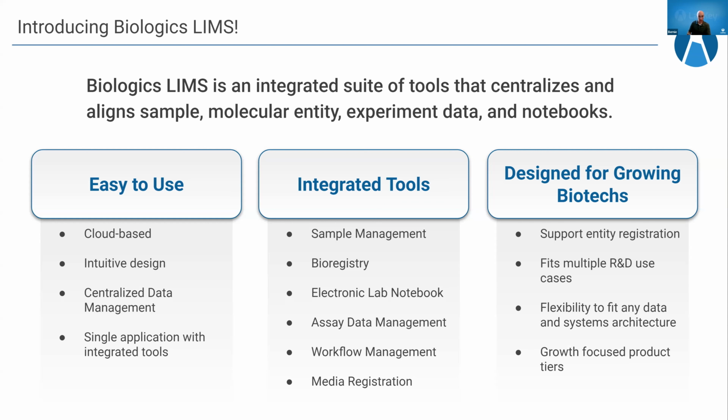That is why having a cloud-based product is so important. You do not need to make a large technology investment to begin getting your data organized. You also do not need a deep IT or informatics team. We have a very experienced support team prepared to train up your scientists and your administrators and guide you through implementation.